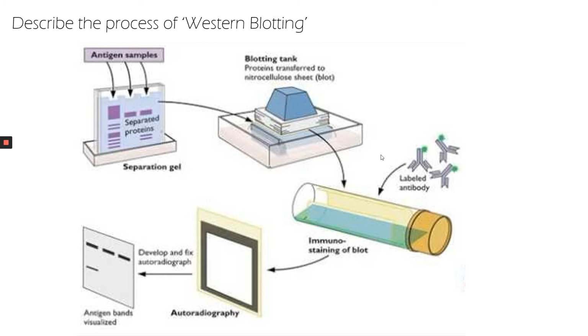In Western blotting, we can use this technique after SDS-PAGE. The separated proteins from the gel are then transferred onto a solid medium. The proteins can then be identified using specific antibodies that have a reporter enzyme attached. So we can use these antibody techniques to identify different things that we've separated on the gels.